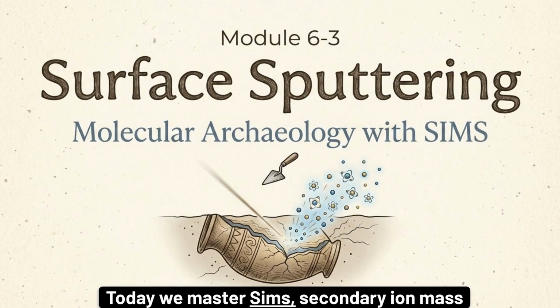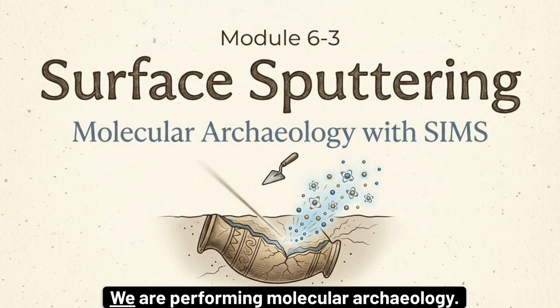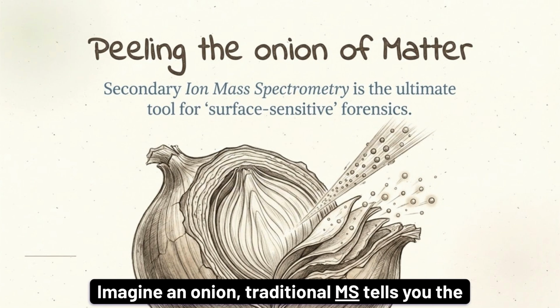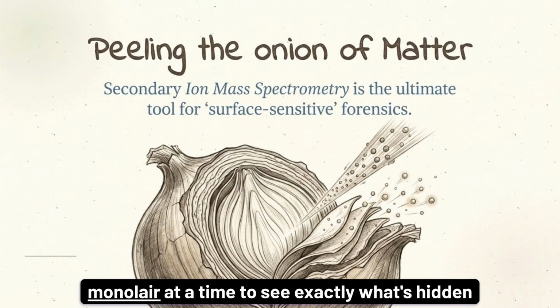Today we master SIMS, secondary ion mass spectrometry. We aren't just analyzing a sample, we are performing molecular archaeology. The difference between a bulk analyzer and a SIMS specialist is the dimension of depth. Imagine an onion. Traditional MS tells you the average flavor. SIMS allows us to peel it back, one atomic monolayer at a time, to see exactly what's hidden beneath.